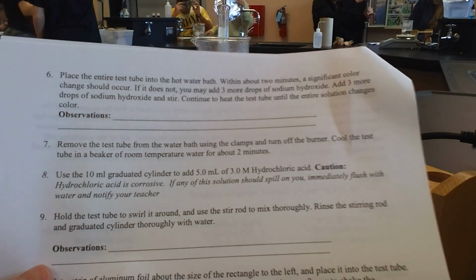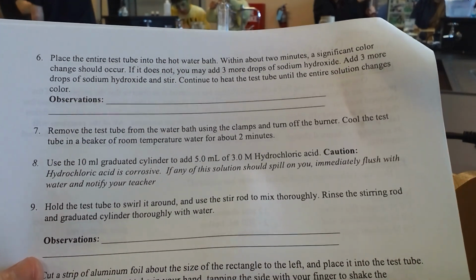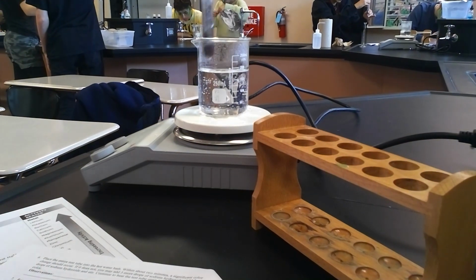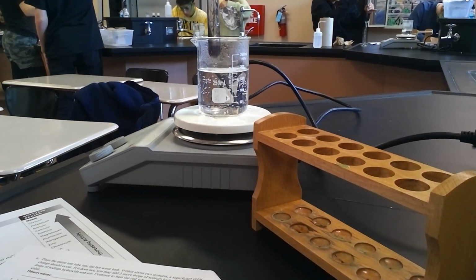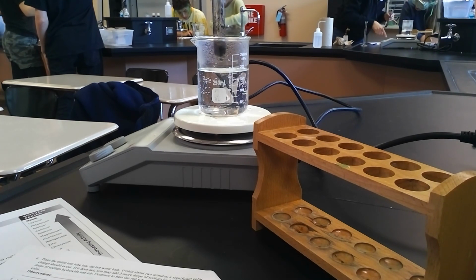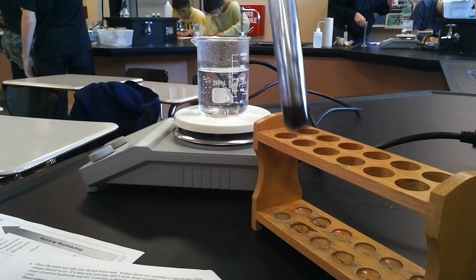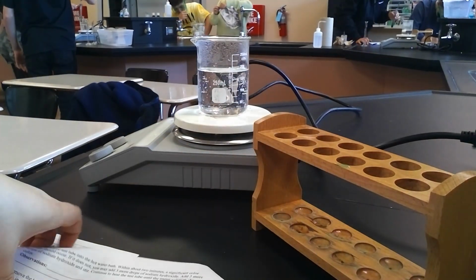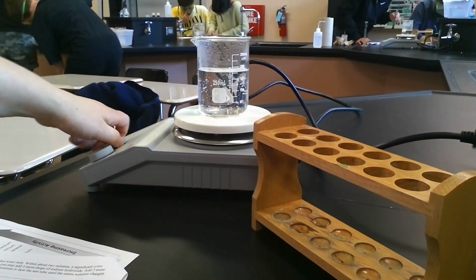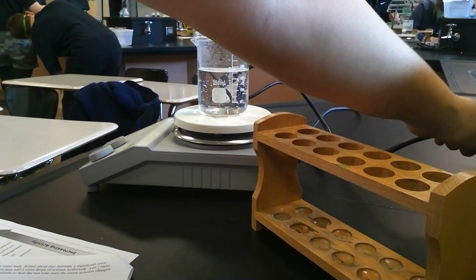Our solution is heating right now. Place the entire test tube into the hot water bath, and within about 2 minutes, a significant color change should occur. So this has been heating for definitely less than 2 minutes, but if I keep stirring it, clear color change. That is a dark, kind of black-brown solution. So I'll hold it up against the paper, that way you can see. Definitely dark, so I'm going to go ahead and turn off my hot plate, unplug it, and then let that water cool down.